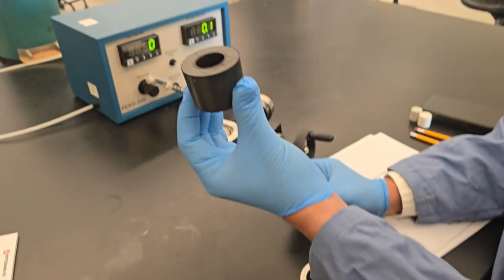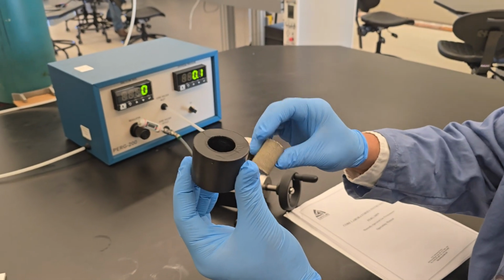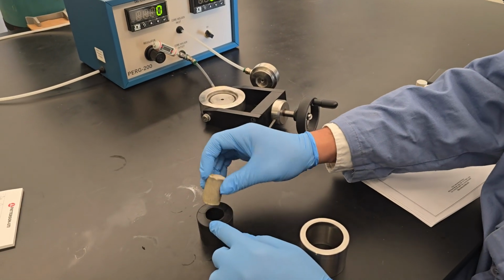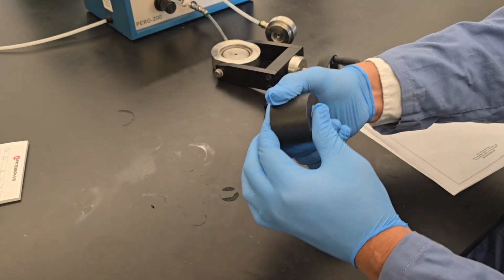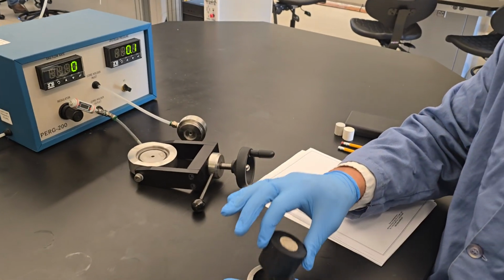It has a shape of a cone. It's a very small shape of a cone or coning shape, so you have to be careful. You put it from the wider part on the top and we slide it down right through. Once it's secured, touch it both sides and we'll put it in here.